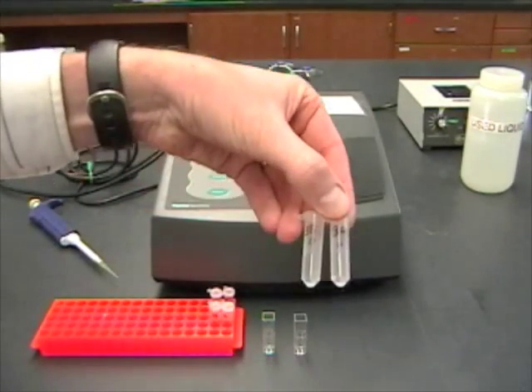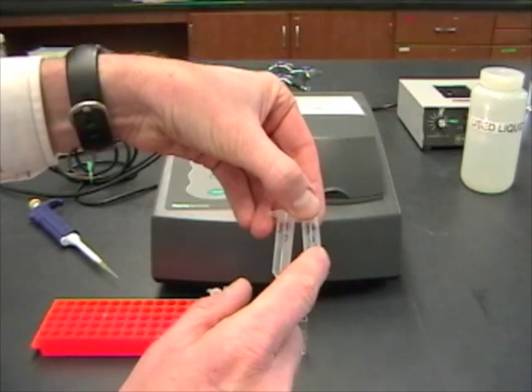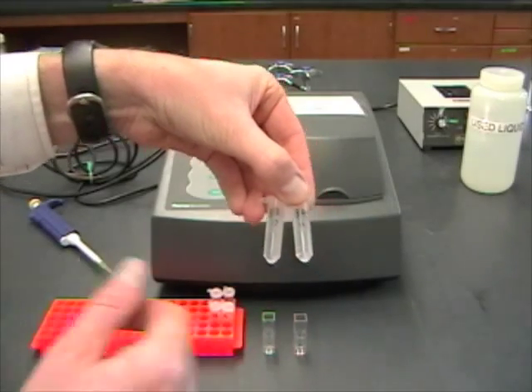For each time point, remember we have two tubes: one labeled B and one labeled C. The B is the blank, and the C is the one that has the substrate in it.